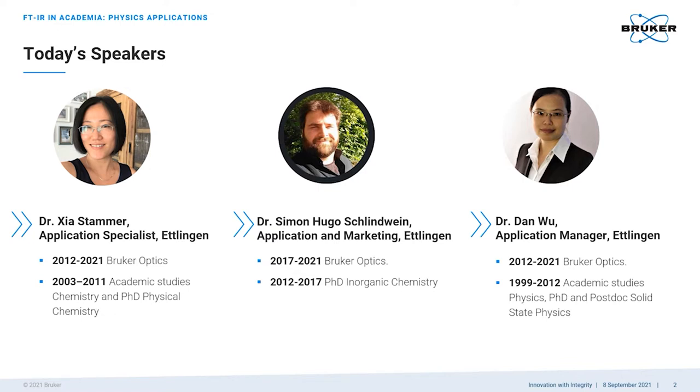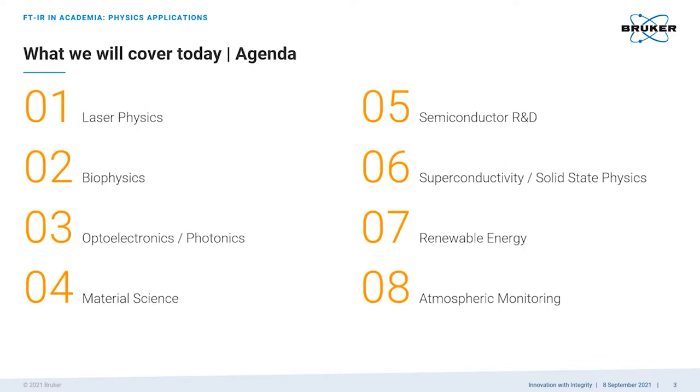Xia will begin by refreshing some fundamentals of FTIR spectroscopy, and after that, we talk about the basic principles of time-resolved techniques in FTIR, as these are frequently needed in physics applications. She will also touch the topic of emission spectroscopy, which is widely applied for material science, semiconductor R&D, and optoelectronic device development in physics. Here's a quick outline of our agenda in today's webinar.